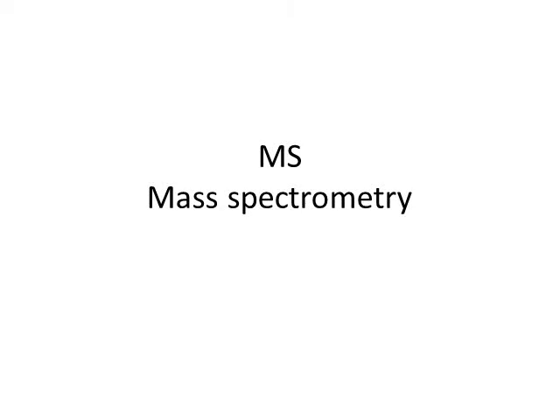Hi, welcome to Organic Chemistry. In this presentation, we're going to look at our final spectral technique, mass spectrometry, often known as just mass spec or MS.